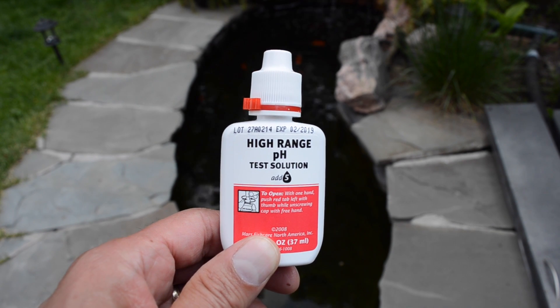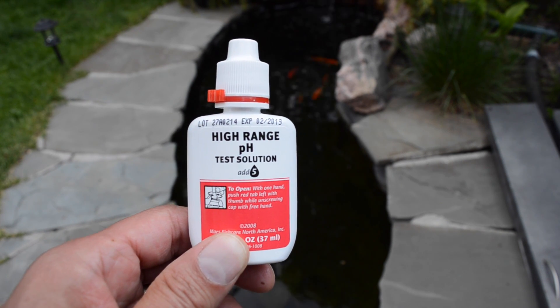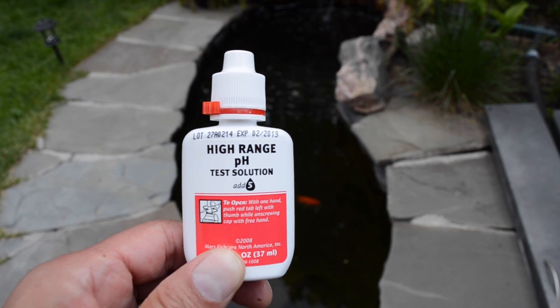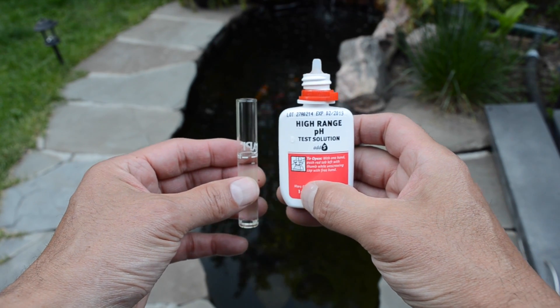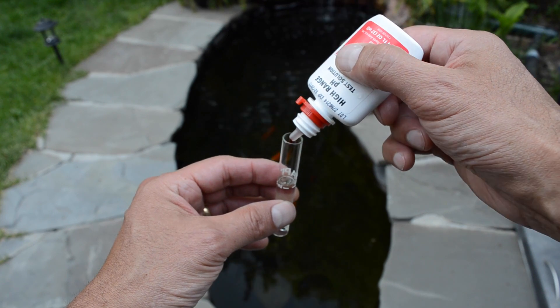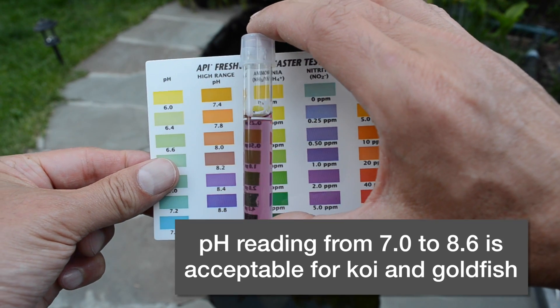Now I'm going to check the pH level with the high-range test solution. This one reads into a higher bracket, going from 7.4 up to 8.8 pH, which is very alkaline. Certain fish like goldfish do like a higher range. For this one we're going to use five drops of the high-range pH solution — take care not to get it on your skin. Give it a good shake, and by my eyes I'd say that's around an 8.4 pH level.